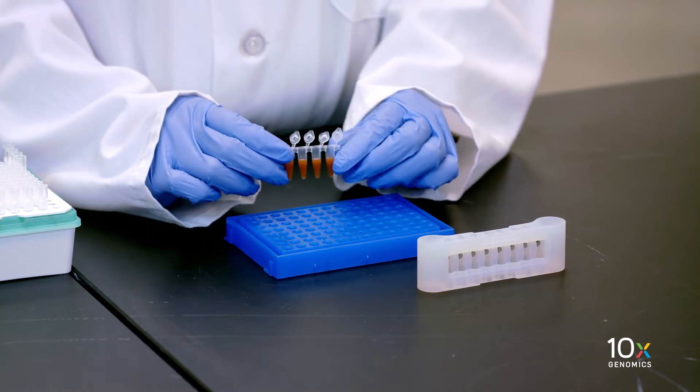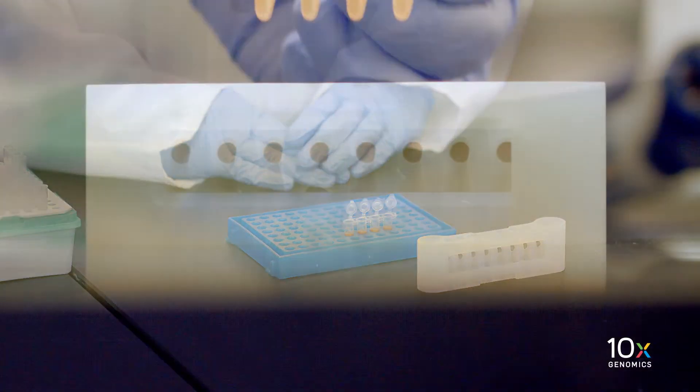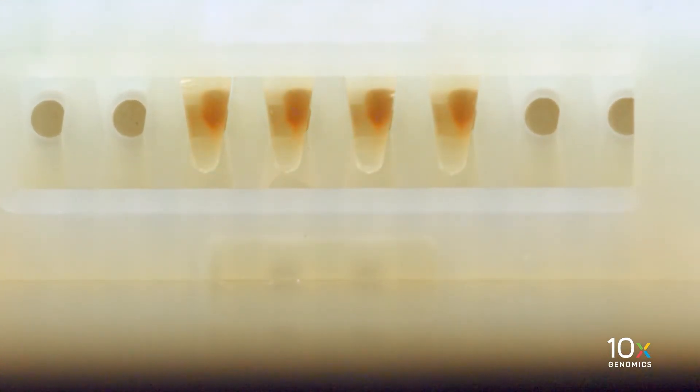Incubate the tube strip at room temperature for 5 minutes. Then place the tube strip in a 10x magnetic separator in the high position until the solution clears.